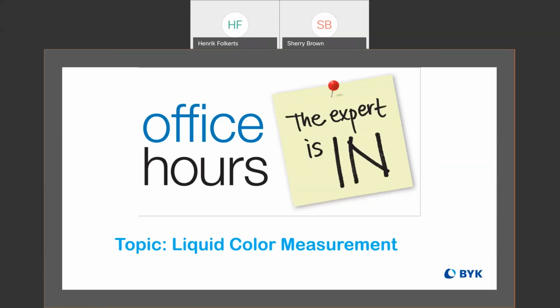First question from Mark here. Does the LCS4 work with fluorescent whitening agents? Let me read that again. Fluorescent whitening agents. Yes. That's actually not something I've ever worked with in this instrument before.